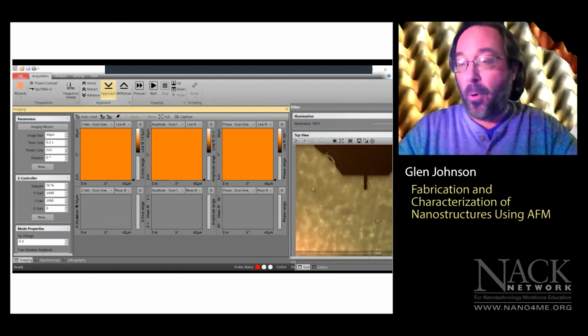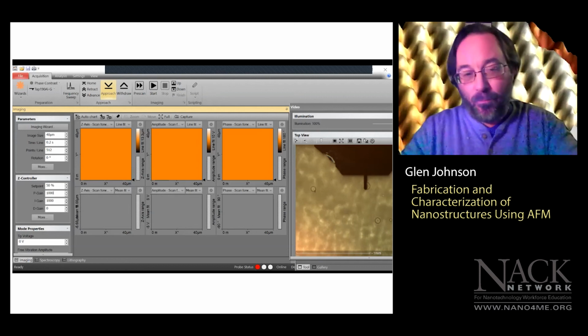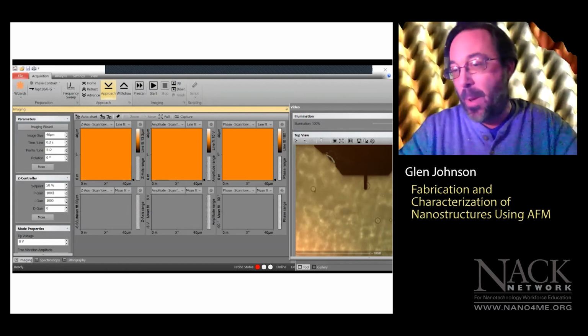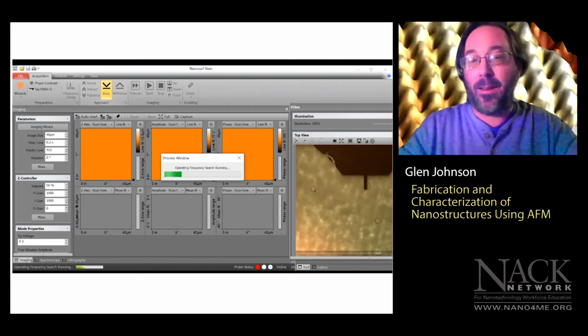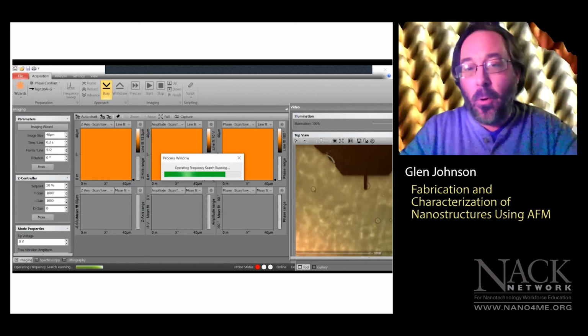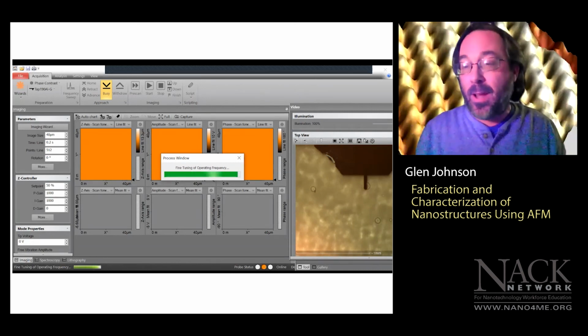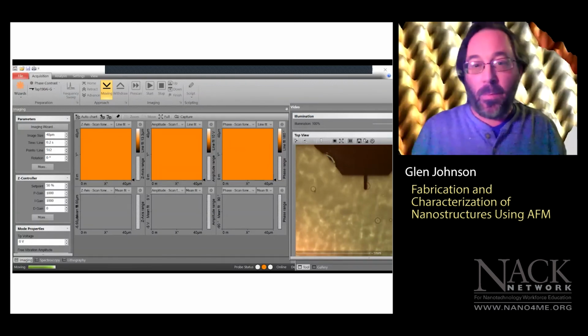I also have a fine approach, and I like to say that as awesome as I am, I can't tell what 50% of that vibrational amplitude is, but the microscope can. So I'm going to select that and let it dictate it. When I do select that, you notice that it's running this frequency sweep. It automatically does it every time I do a fine approach.